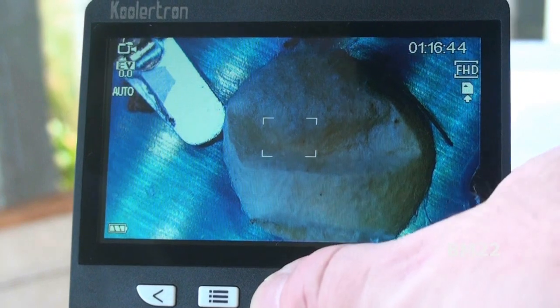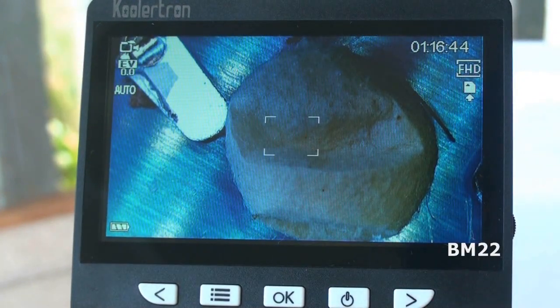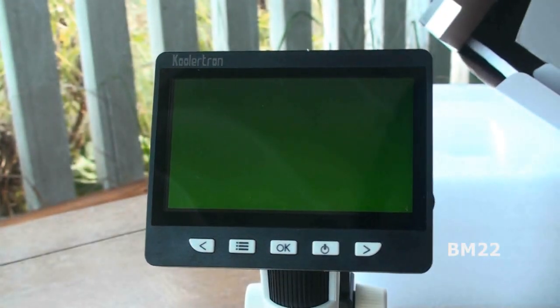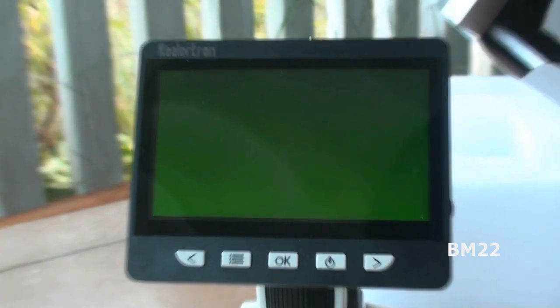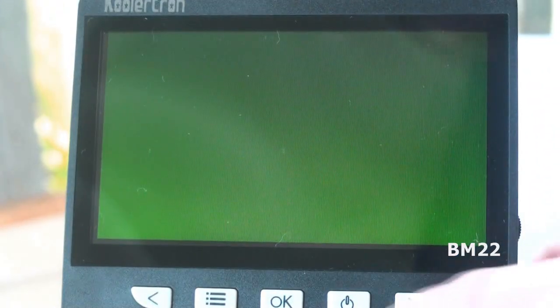This unit, you can either go directly to a computer to record it or into an SD card. I prefer the SD card method. And this looks like the green screen of death. All right, so everything is locked up here. We cannot do anything. This is completely unresponsive.